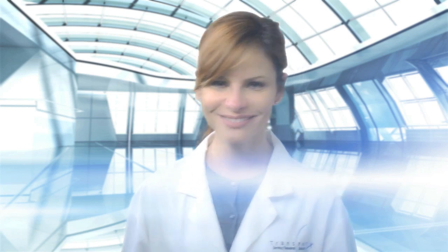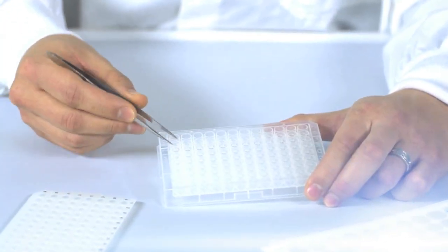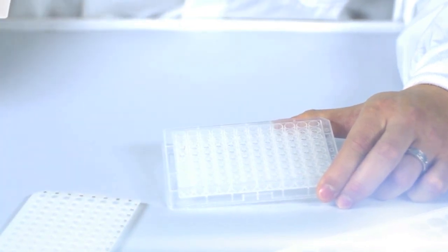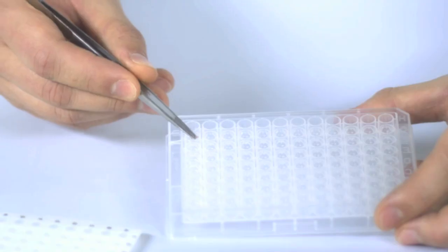Let me show you how the process works. You begin by loading your samples into a Transnetics well plate. No buffers, freezing, or pre-treatment is required. Simply load your tissue samples into the plate and seal it with the rubber cap mat.